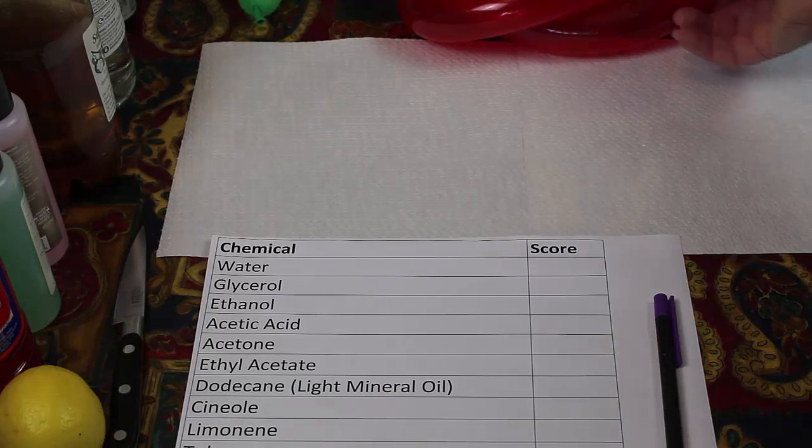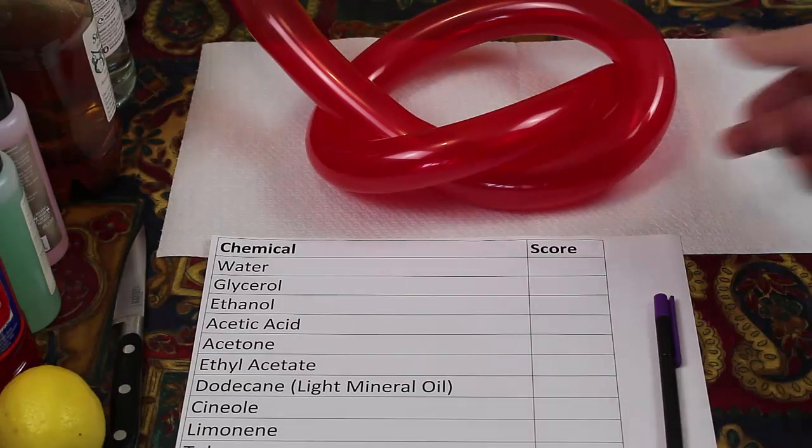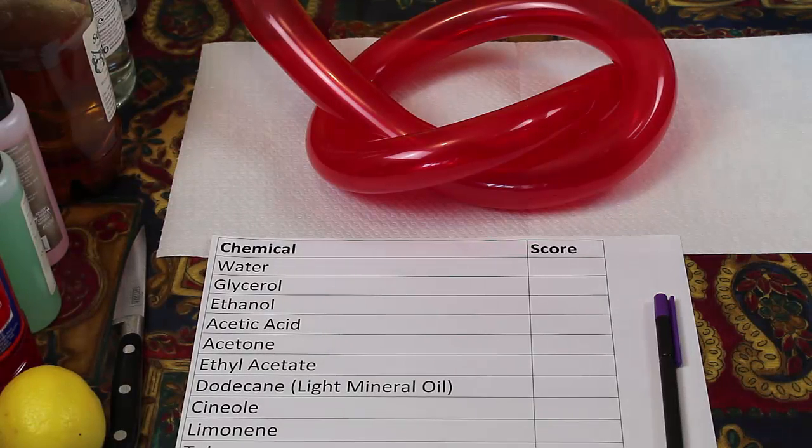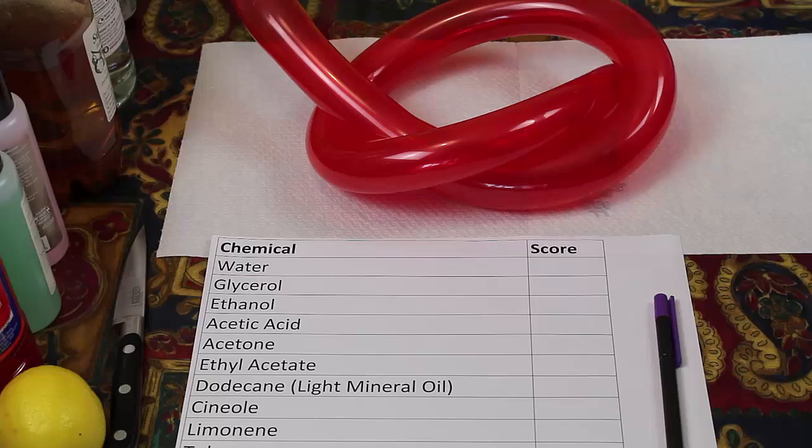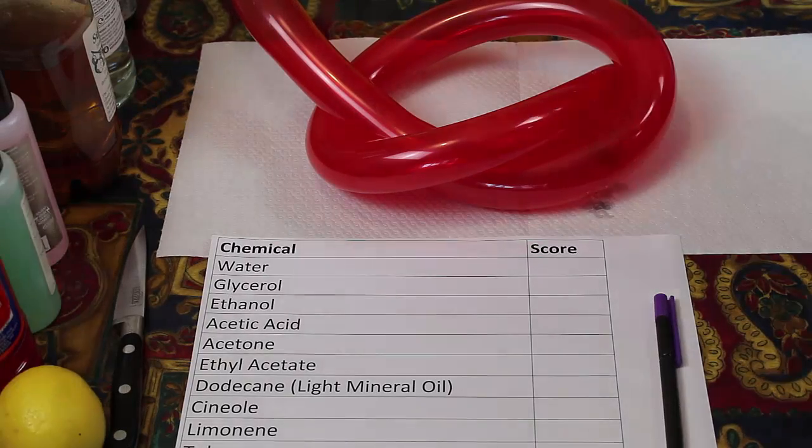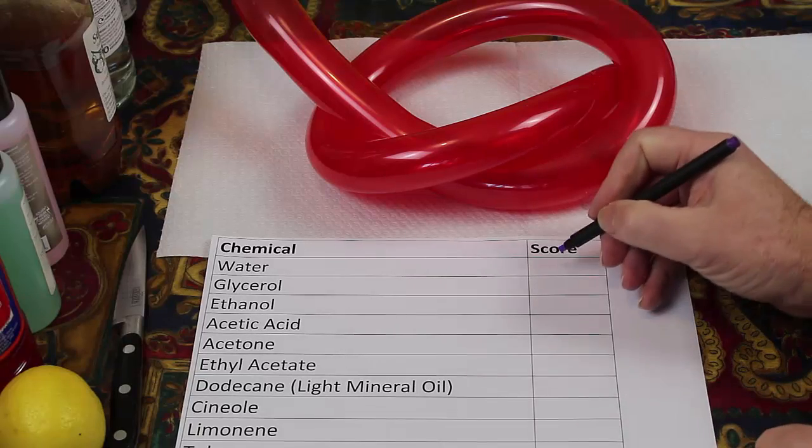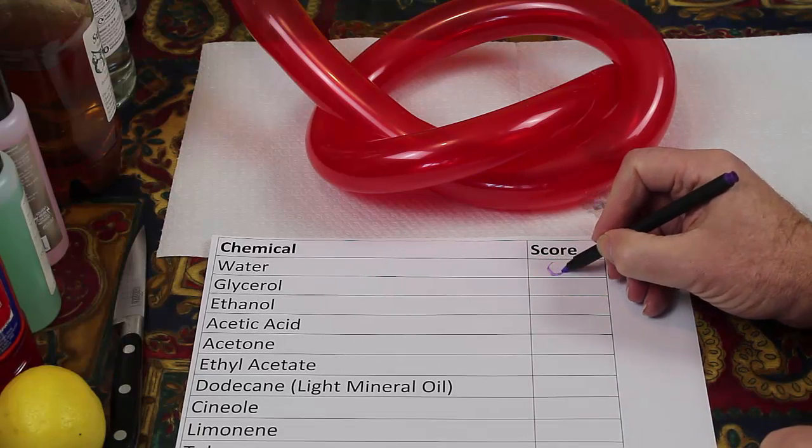I have some polyisoprene and I test it with some chemicals. The first chemical is some water and of course I pour it over, the water does nothing. So I can say that the polymer, the polyisoprene, is not happy in water so I give it a zero.